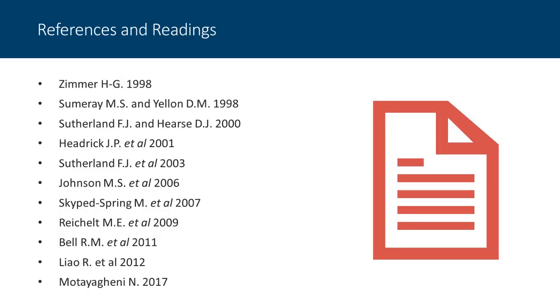So just to point you towards some reading that will help solidify the uses, the benefits, and what sort of key decisions need to be made in the process of addressing Langendorff setups. These are some of the references that I would point you towards.